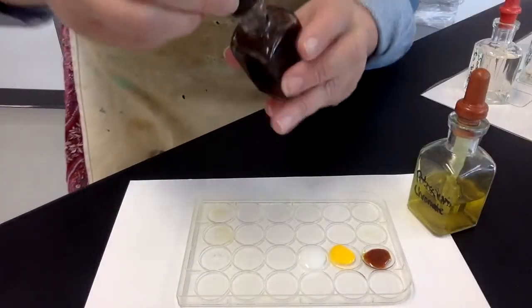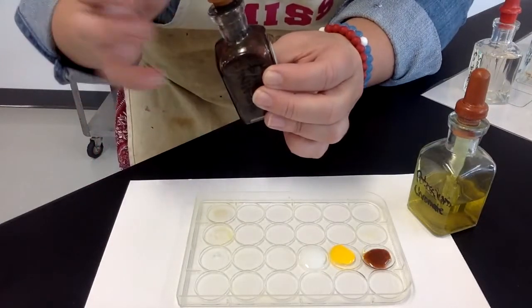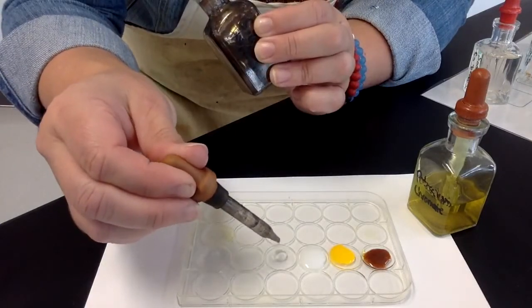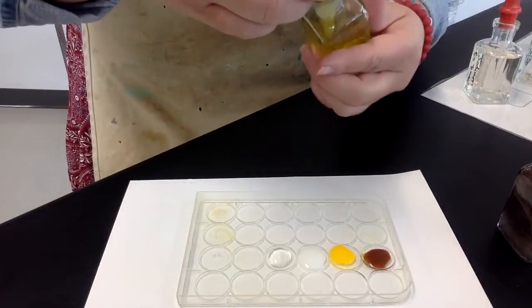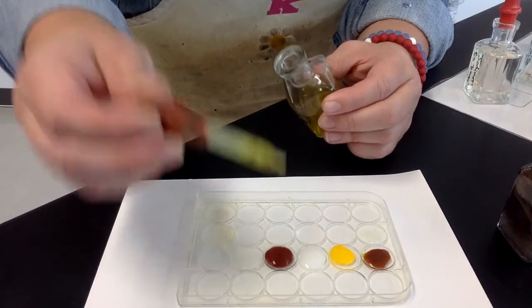Okay, so silver nitrate, it looks like the bottle has been tinted because silver nitrate starts to break apart if it gets too much light. So you'll see that the actual silver nitrate is clear. So you got your clear little dots here, and then we've got this yellowish potassium chromate. So that was silver nitrate. This is potassium chromate. Look at that one.